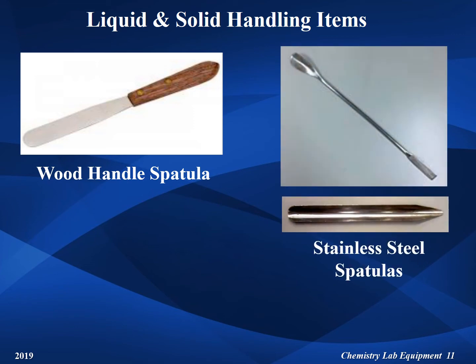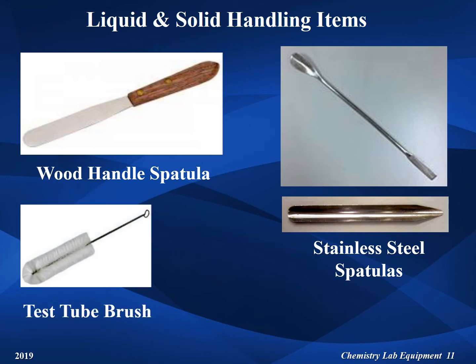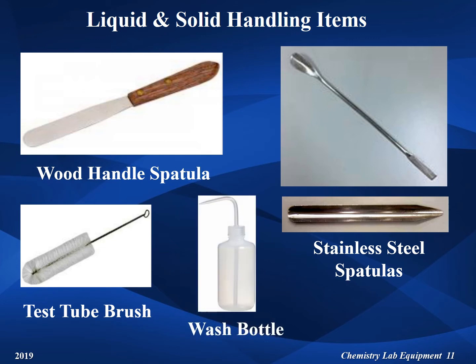stainless steel spatulas, test tube brushes to thoroughly clean test tubes, polyethylene wash bottles primarily used for cleaning glassware.